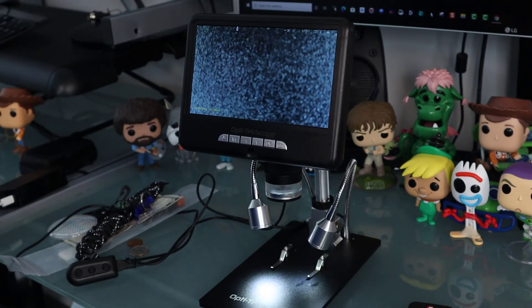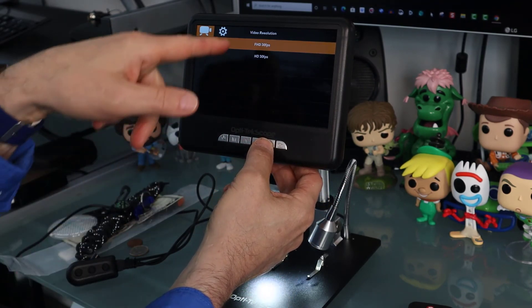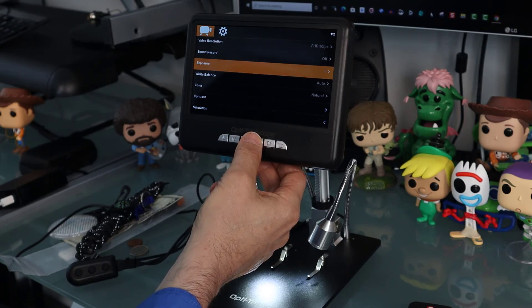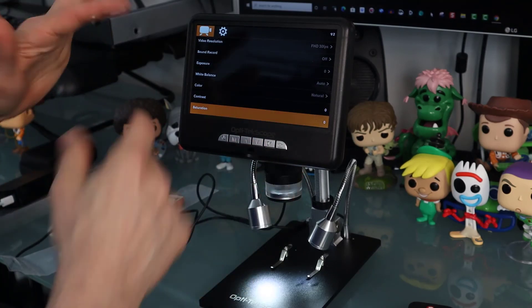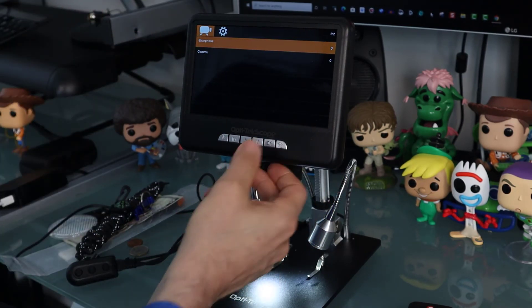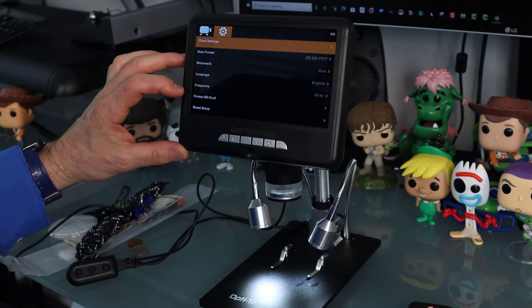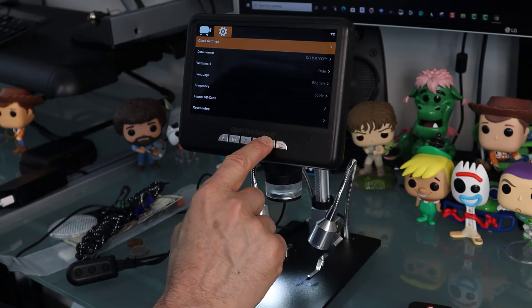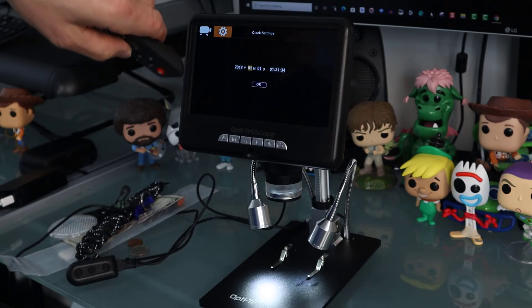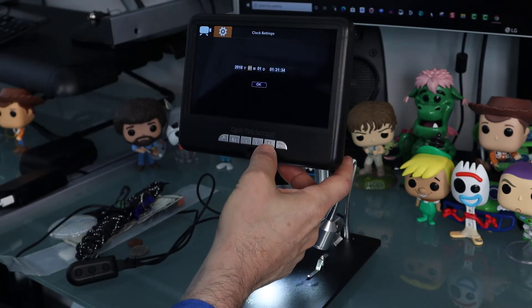To get to the features, press and hold the M button. That gives you video resolution — full HD 30 frames or HD 30 frames per second. You've also got sound record, exposure, white balance, color, contrast, and saturation. These settings are important for someone particular about coloring. Going down further you have sharpness and gamma. Press M again and you get to clock settings, date format, watermark, language, frequency, format SD card, and reset. It's a lot easier to navigate by clicking the buttons directly on the microscope rather than the remote control.